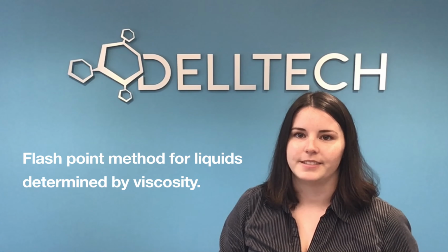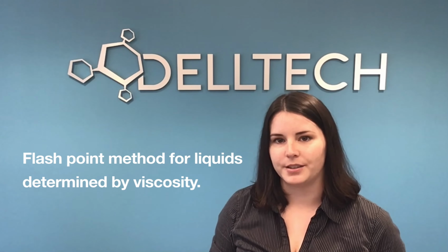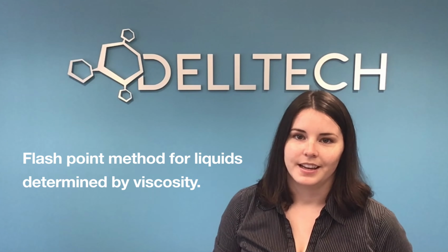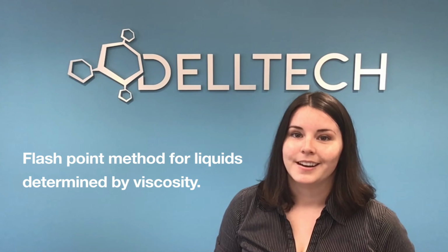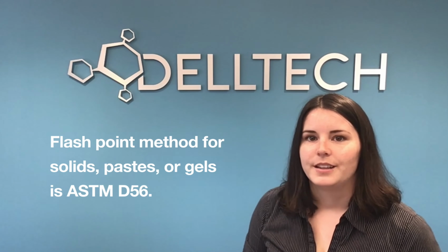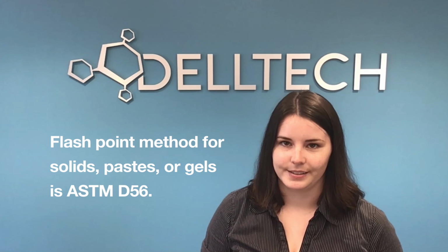In the CCCR, you'll see that the flashpoint method to be used in testing liquid products is determined by the viscosity of the liquid. Samples with a viscosity less than 5.8 millimeters squared per second at 37.8 degrees Celsius are tested with ASTM D56, and liquids with a viscosity of 5.8 millimeters squared per second or more at 37.8 degrees Celsius are tested with ASTM D93. The flashpoint of solids, pastes, or gels is determined using ASTM D56.